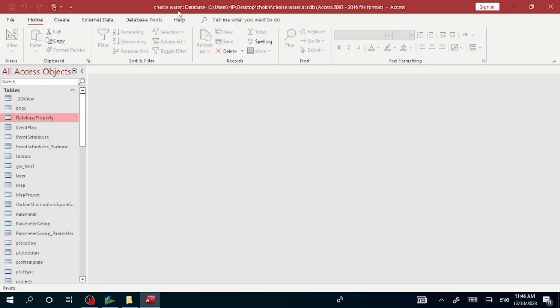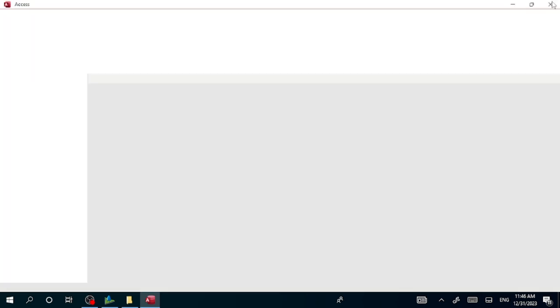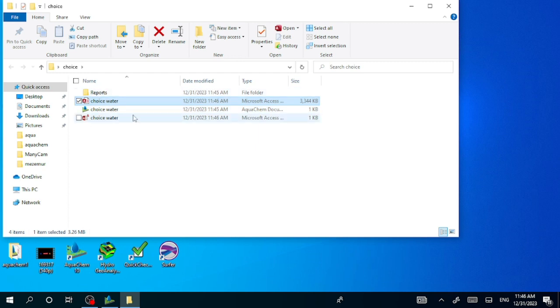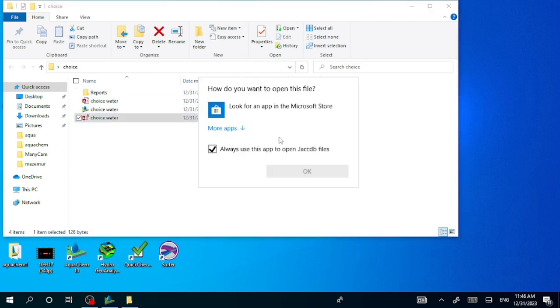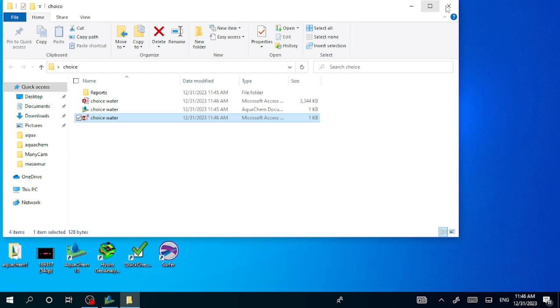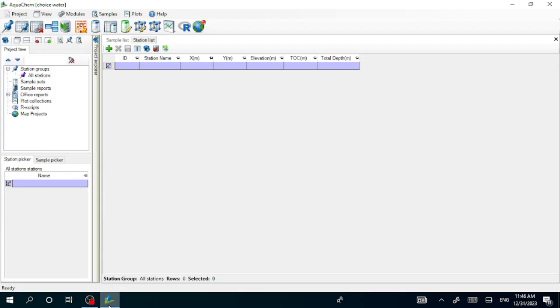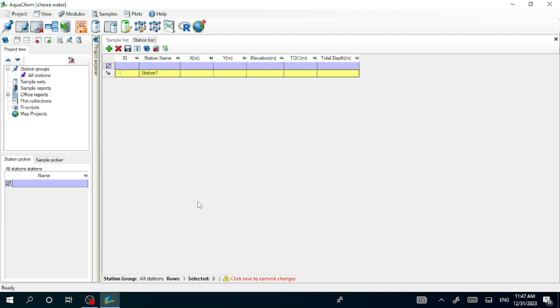This is the setup for the project — nothing is here except setup. Let us continue. The first thing here is, just as we created a project, let us create a station. Here is the station list to create a station — click 'Add New Station.'